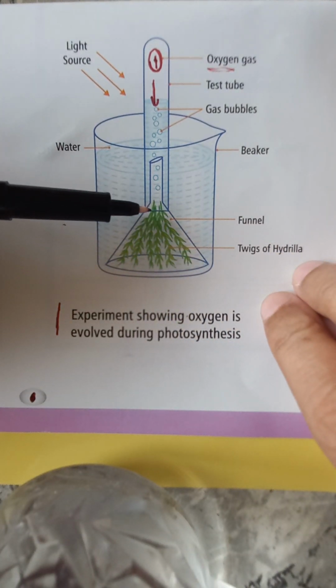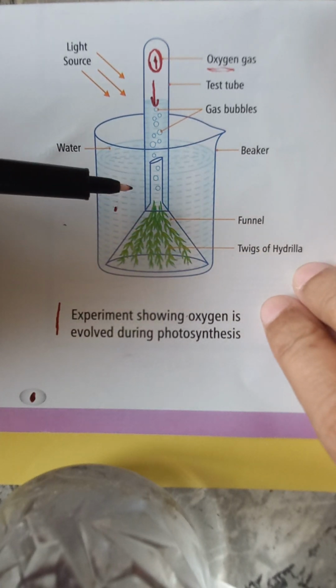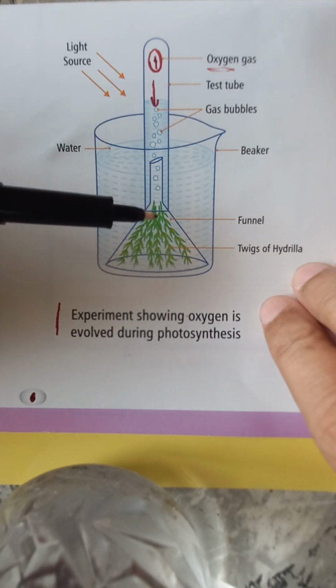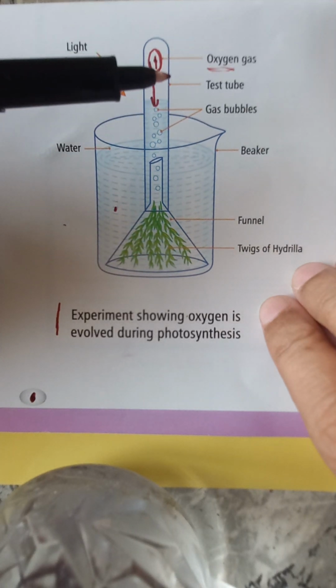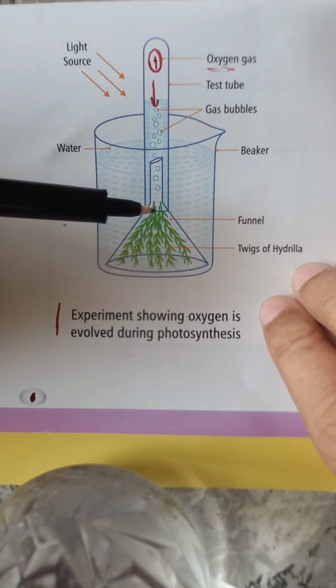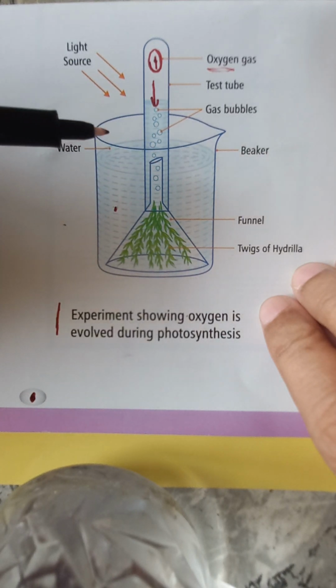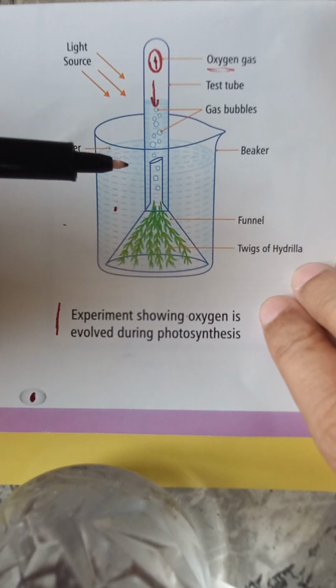Now you see this is a short stemmed funnel. You have to invert the funnel on the hydrilla plant and take a test tube full of water and invert it on the stem, and always keep in mind that the water level in the beaker should be above the stem of the funnel, otherwise it is not going to work.